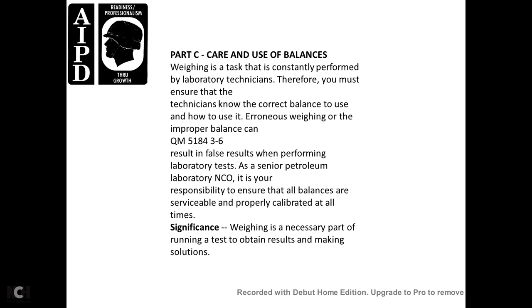All right, Part C, care and use of the balance. When weighing is constantly performed, the laboratory technician must ensure that technicians know how to care for the balance and how to use it. Erroneous weights from an improper balance result in faulty laboratory results. The senior petroleum laboratory NCO, it is your responsibility to ensure that all the balances are serviceable and properly calibrated at all times.